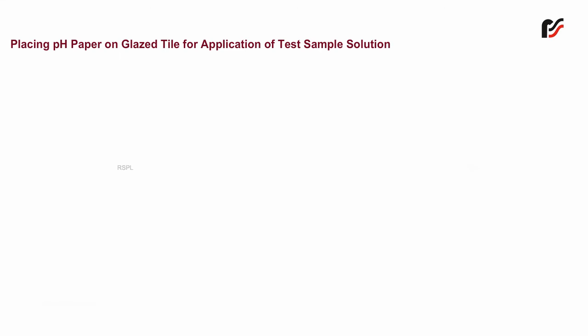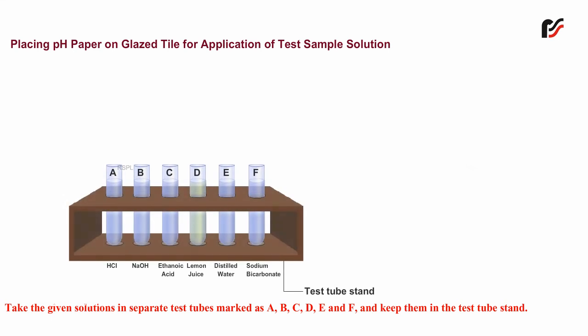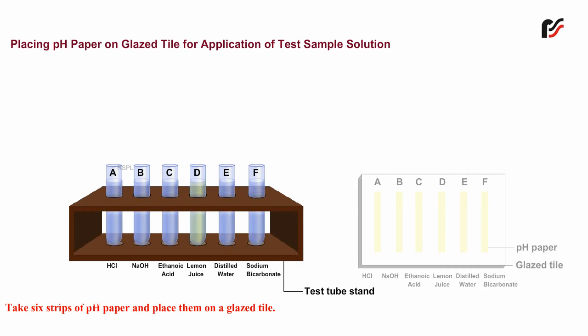Place pH paper strips on a glazed tile for application of test sample solutions. Take the given solutions in separate test tubes marked as A, B, C, D, E, and F and keep them in the test tube stand. Take 6 strips of pH paper and place them on a glazed tile.